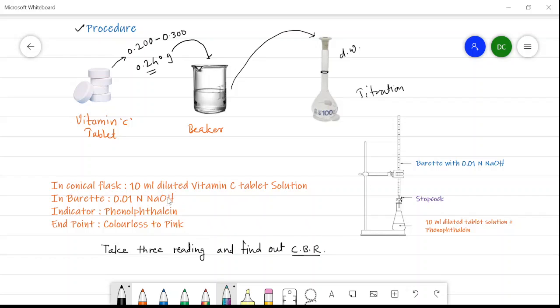We pipette out 10 ml of the solution, add phenolphthalein, and titrate with 0.01 normal NaOH to get the first, second, and third burette readings. After taking three readings, we find the constant burette reading — at least two out of three readings must be the same, similar to what we have seen in the estimation of esters.